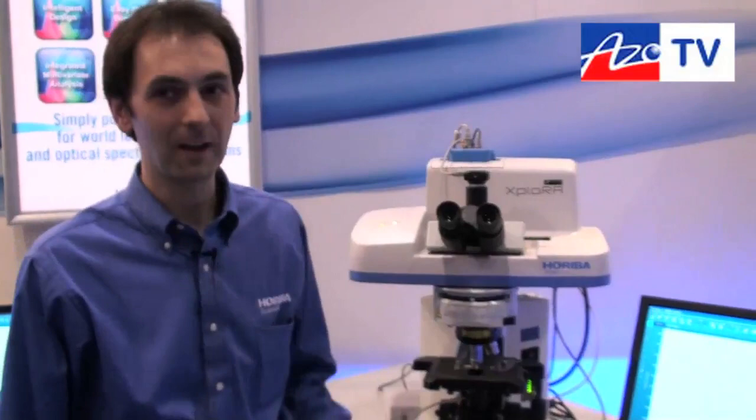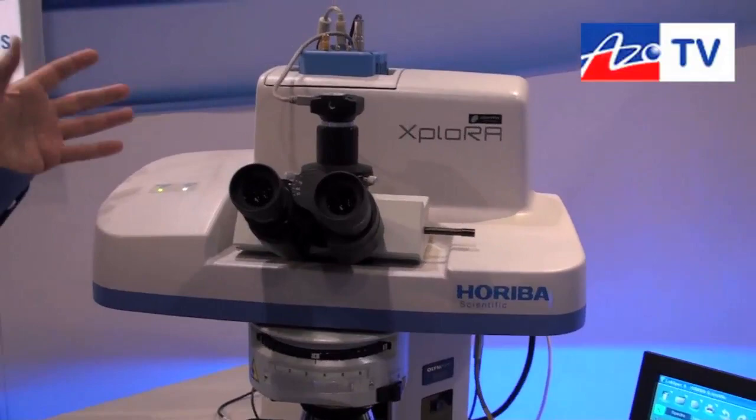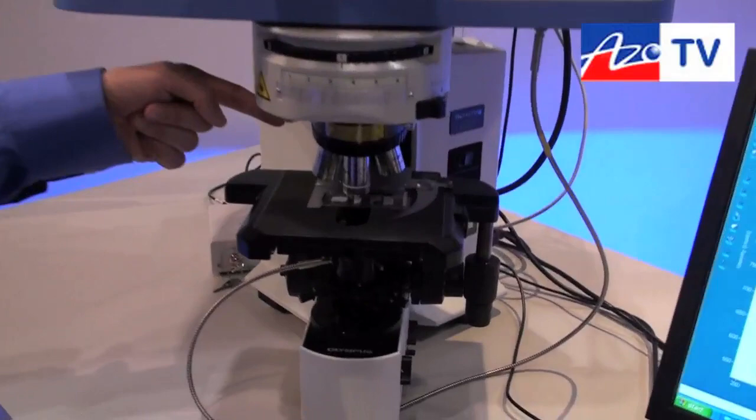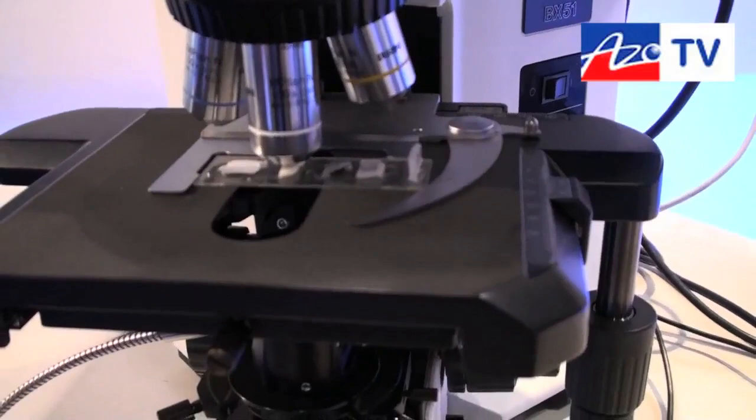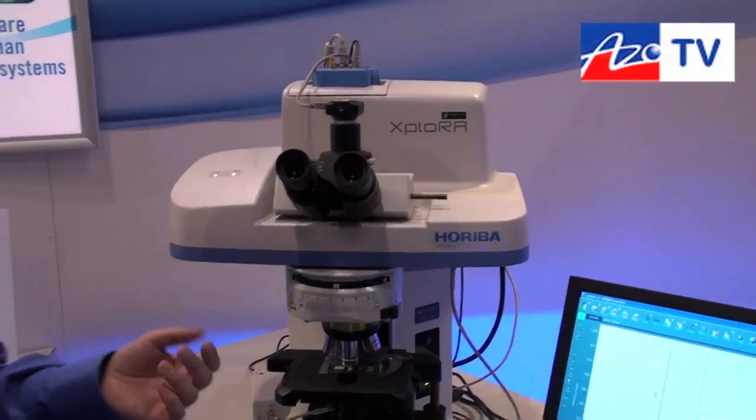This is the Explorer Raman spectrometer. Basically this spectrometer is equipped with a laser that is going to be sent to the sample through the microscope. We focus the laser light on the sample and produce the Raman signal that we're going to analyze in the instrument.